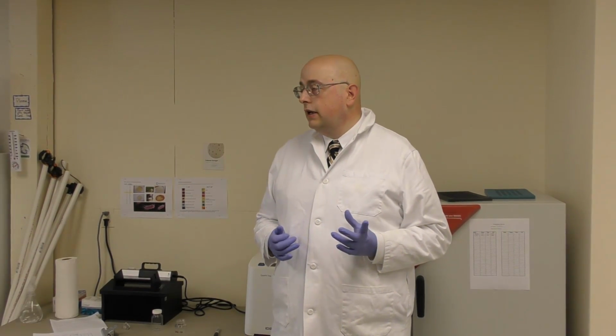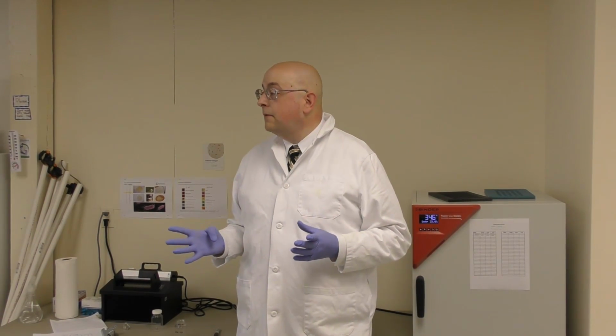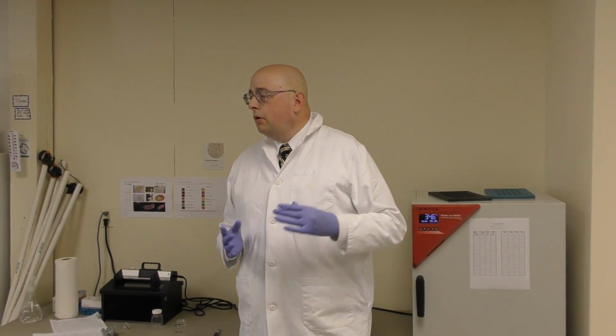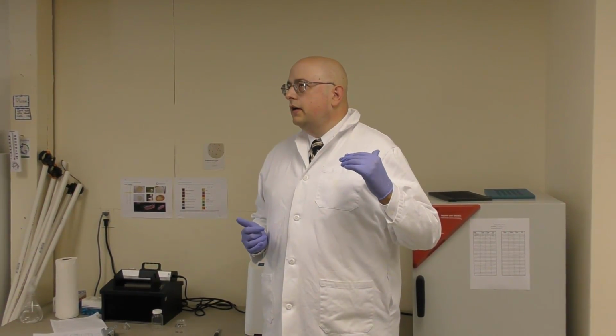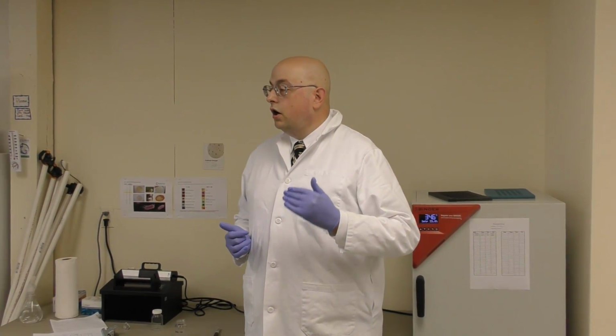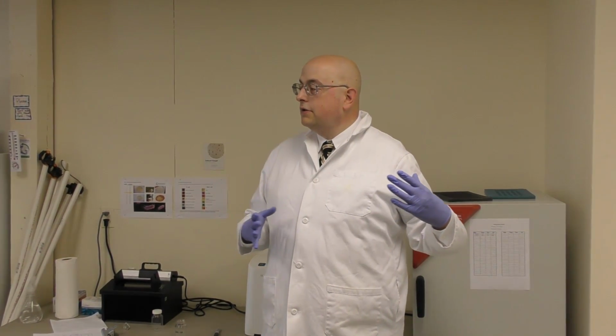All right, so now the samples are going to be incubated. The ideal time is 24 hours. However, you're given, I believe, 2 hours either way, so 22 to 26 hours is the optimal time to pull them out. If you pull them out a little earlier or later, it's probably going to be okay, but you really do want to try and stay within 22 to 26 hours. If you let them sit much longer, after 26 hours, the compound that causes the bacteria to fluoresce will start to break down, and it'll get harder and harder to identify the bacteria.